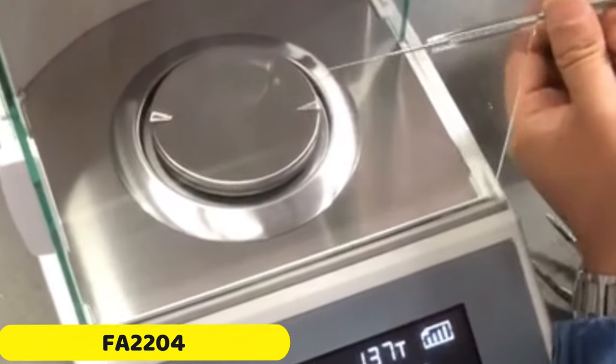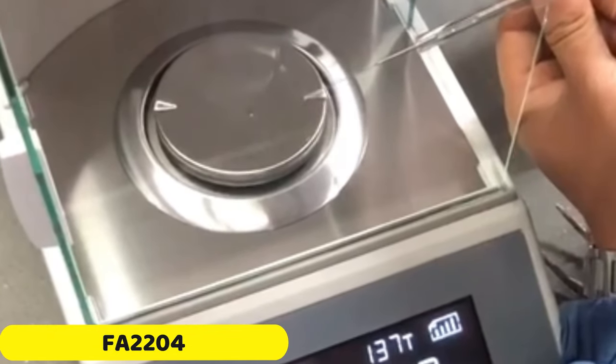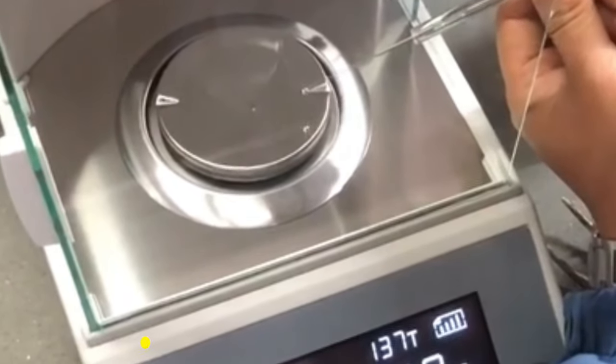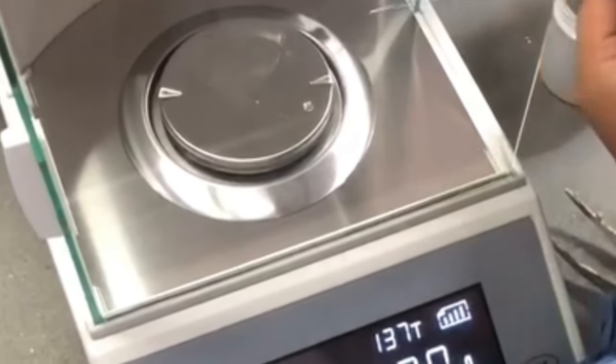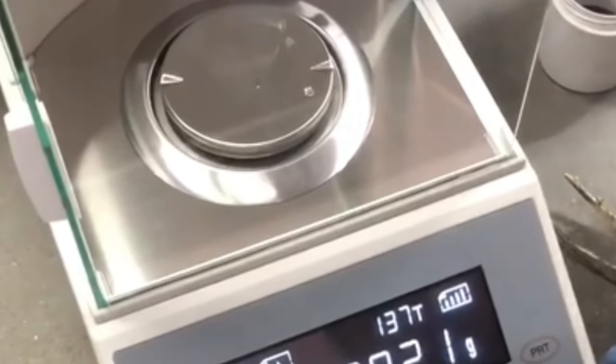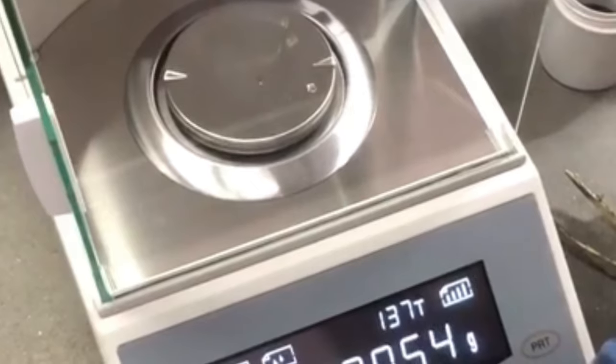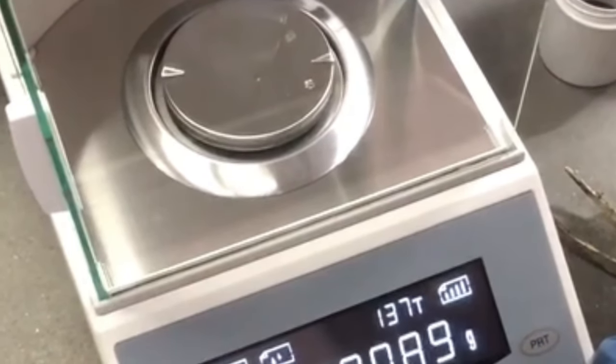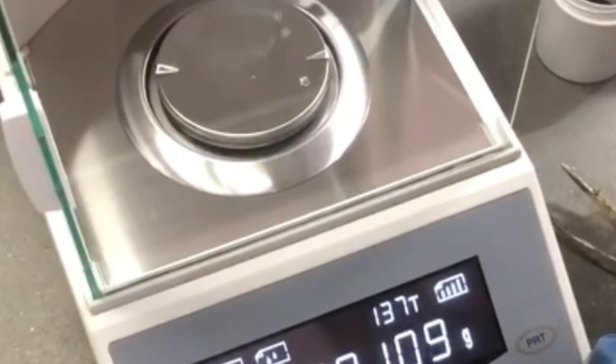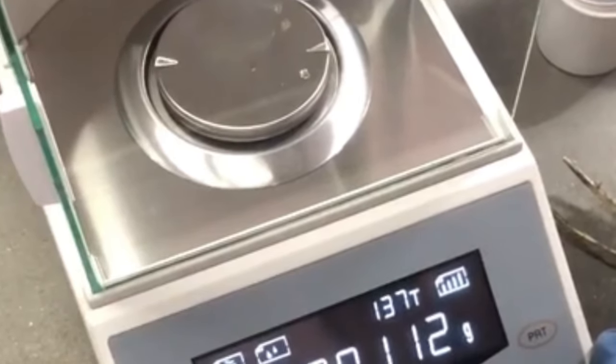Number 4: FA2204 Analytical Balance. The FA2204 Analytical Balance by US Solid is reliable and precise laboratory equipment, with a capacity range of 10 mg to 220 g. Its compact dimensions optimize laboratory space and ensure convenience in placement. The balance delivers remarkable accuracy of 0.1 mg, ensuring reliable and consistent results in every measurement.